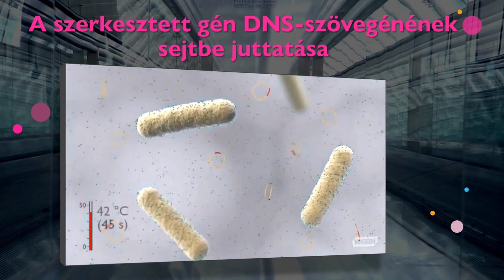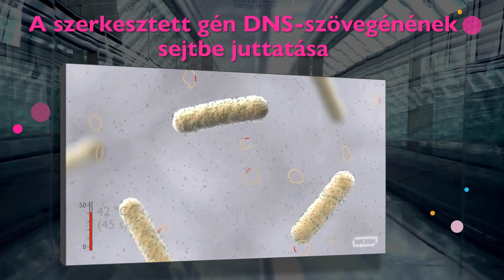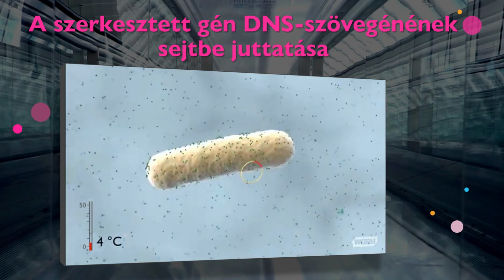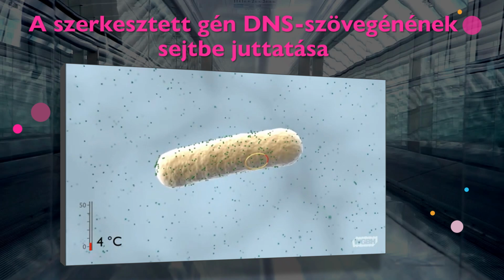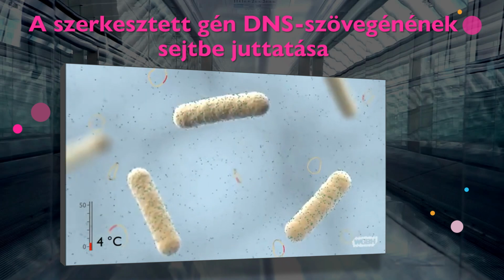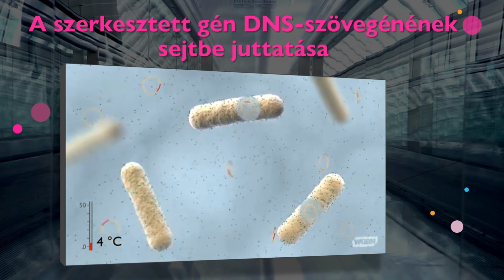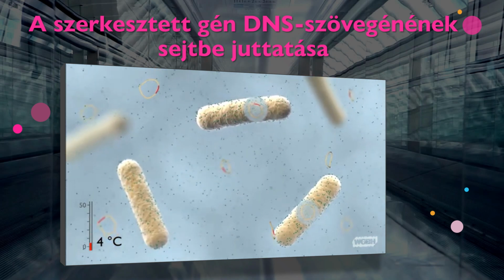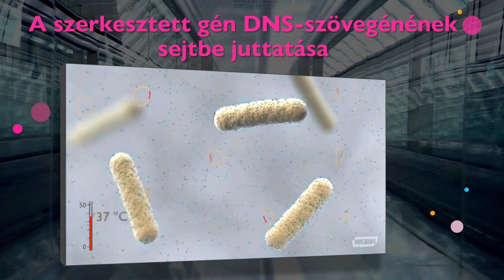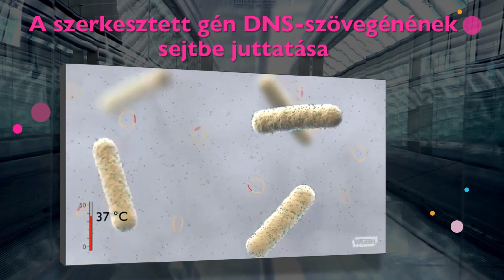The temperature is quickly increased to 42 degrees Celsius, and then reduced back to 4 degrees Celsius. This heat shock results in the formation of adhesion zones, creating a leaky plasma membrane. This may enable the cell to take up a plasmid from the solution. After heat shock, the bacterial cells are placed at 37 degrees Celsius and allowed to recover before being plated.